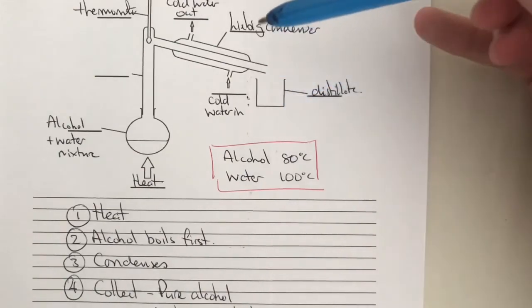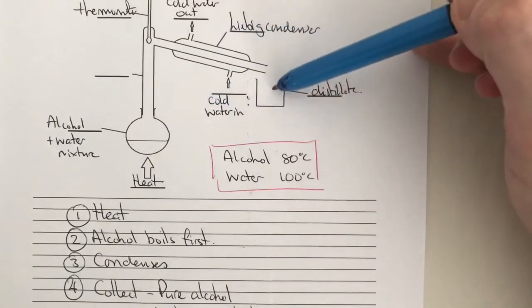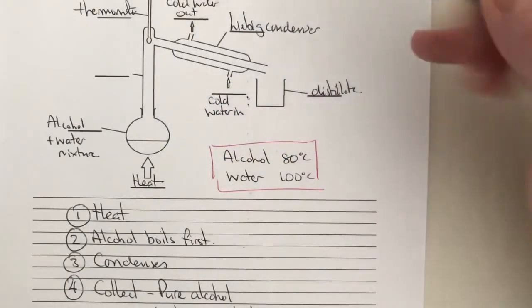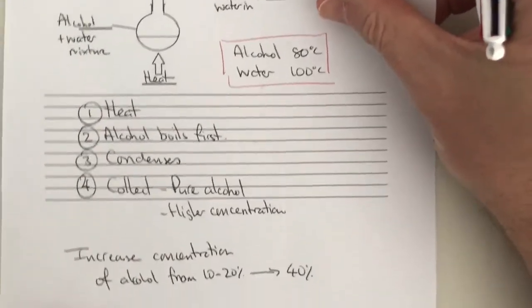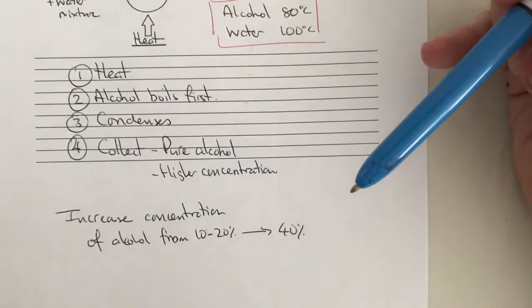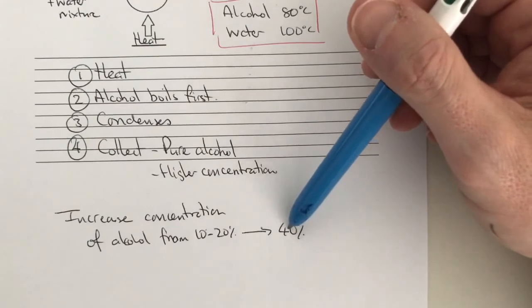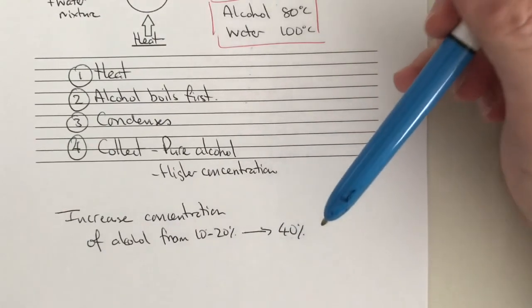Okay, now it might be when you do this once, you will have some water still remaining a little bit. So what you could then do is take this distillate and do the whole thing again, and you might repeat that a couple of times. That will allow you to increase the concentration of your alcohol from somewhere around 10 to 20% from the fermentation process up to 40%. In some alcoholic drinks, you notice they have a concentration this high, and that's how they achieve that level of alcohol in there.